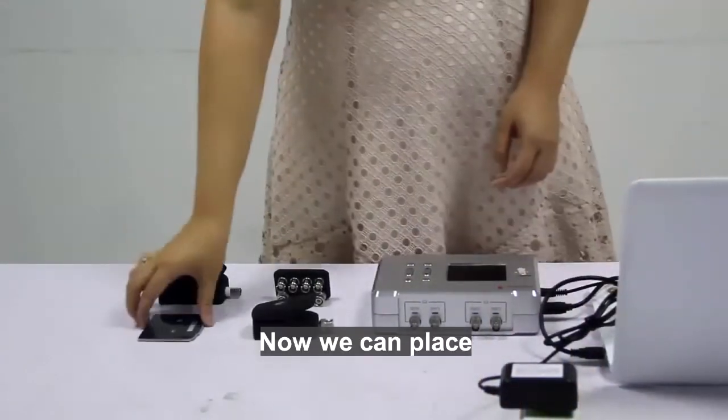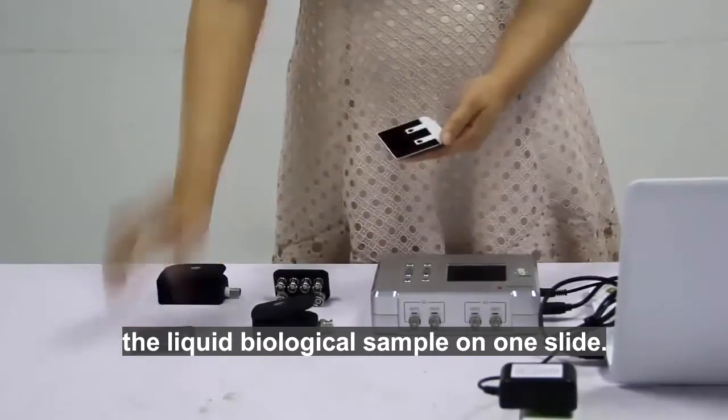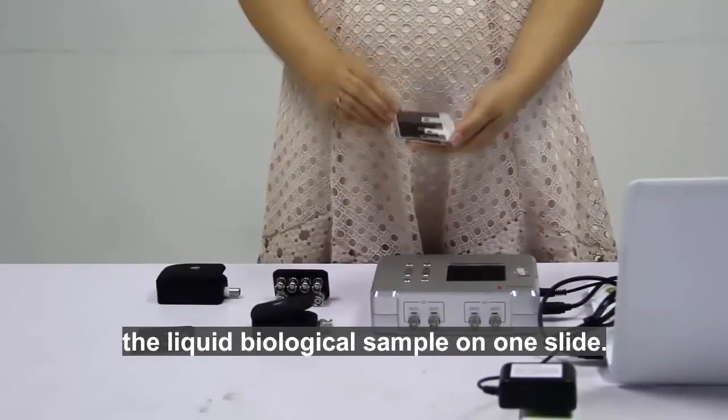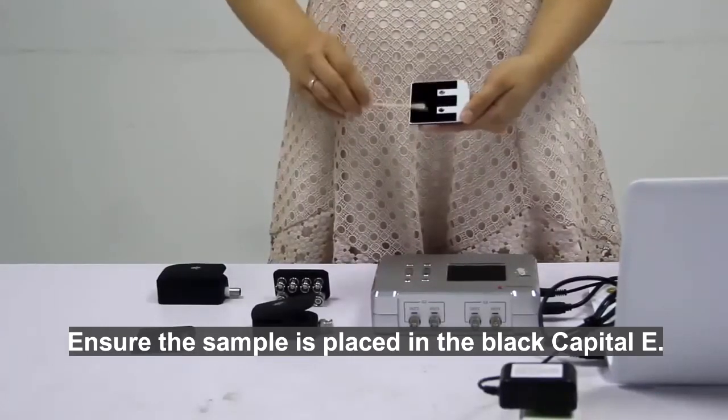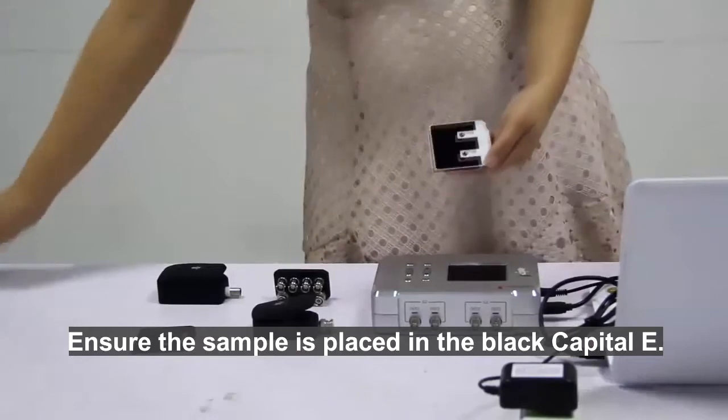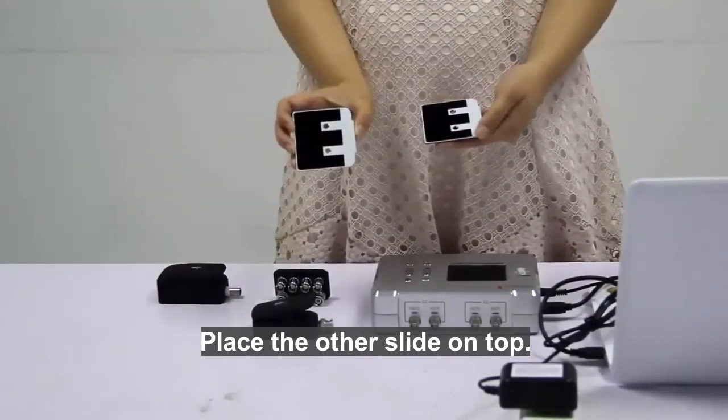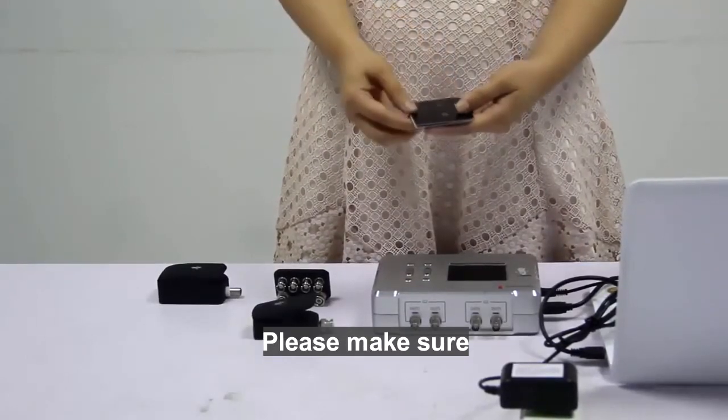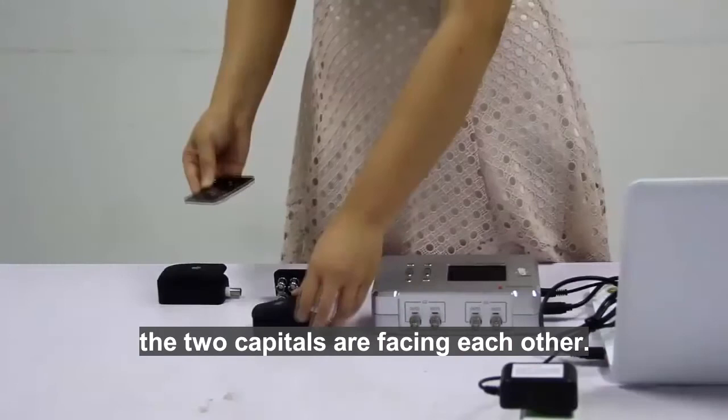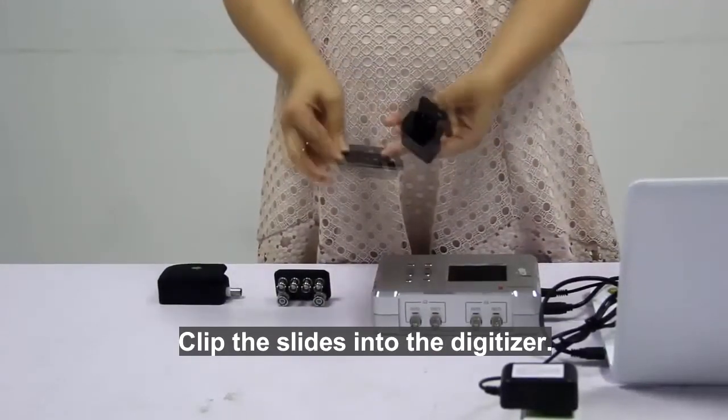Now we can place the liquid biological sample on one slide. Ensure the sample is placed in the black capital E. Place the other slide on top, making sure the two capitals are facing each other. Clip the slides into the digitizer.